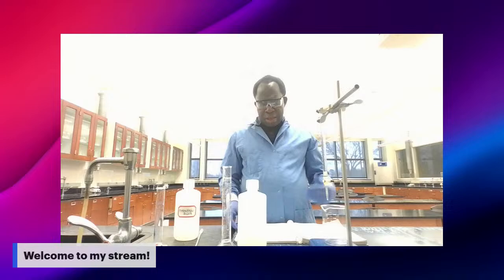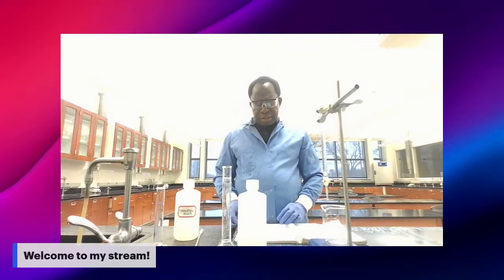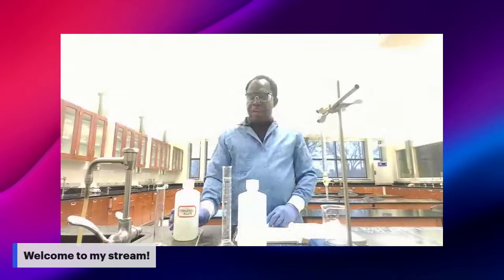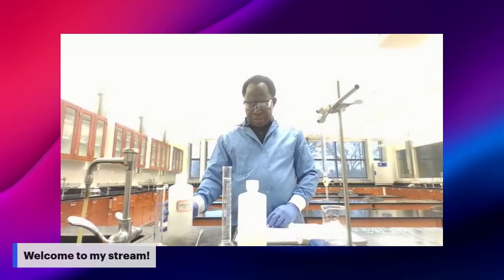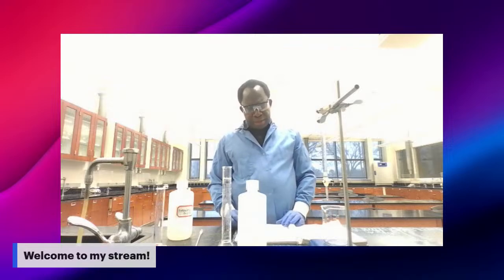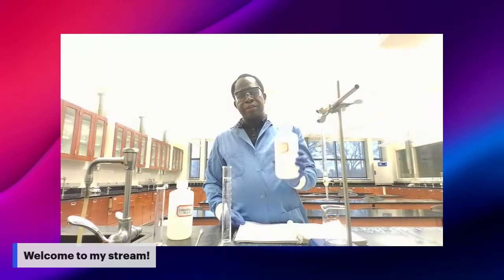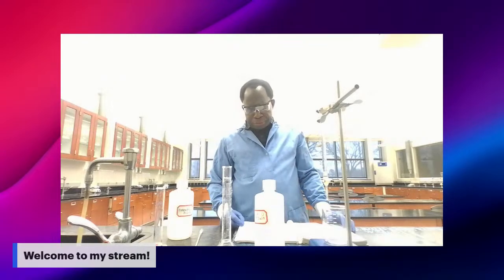So the purpose of this experiment is to determine the acid dissociation constant of an unknown sample. You have the unknown sample here. This is the unknown acid. To do this, you will titrate the sample with a commercially prepared strong base. We have our base here, 0.1 molar sodium hydroxide, that we are going to use for the lab.